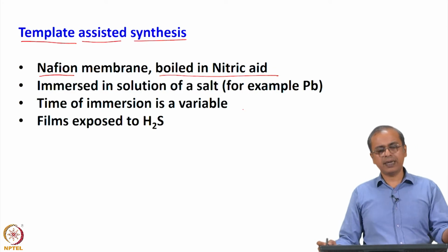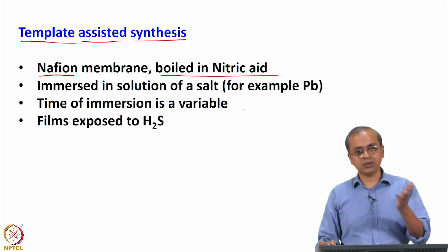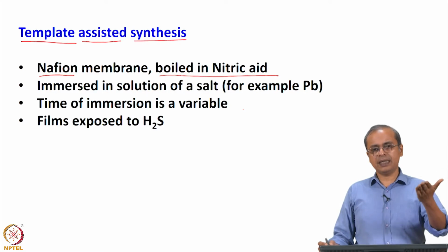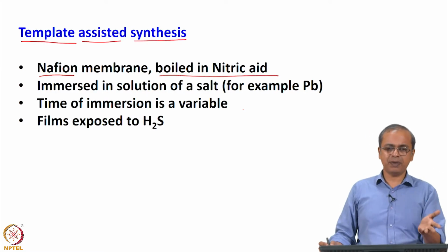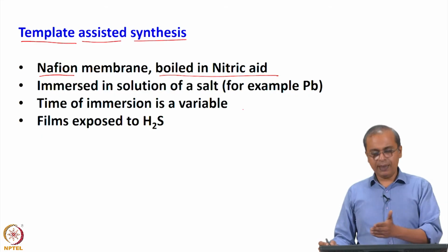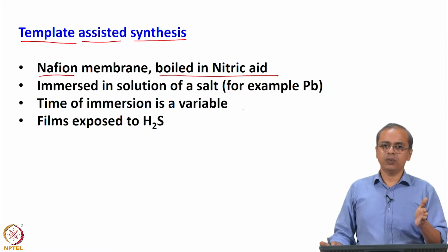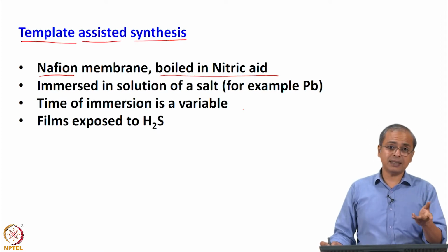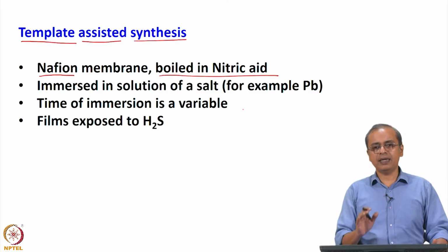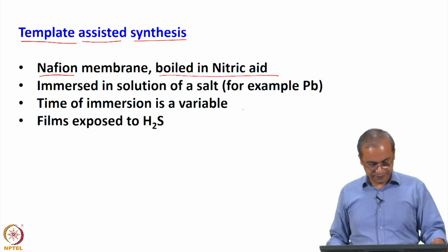So, by chance during the synthesis process, if there is still some sodium present in it or some other salt has penetrated in it, we can make sure that it's no different than washing some other sample before you start using it, washing some vessel, etc. We basically boil it in nitric acid to remove any residue that may be present from some prior handling of this membrane, and so you can feel reasonably confident that what you have is clean Nafion membrane.